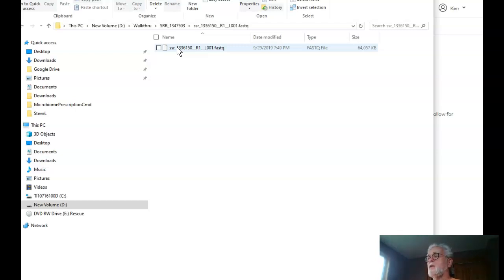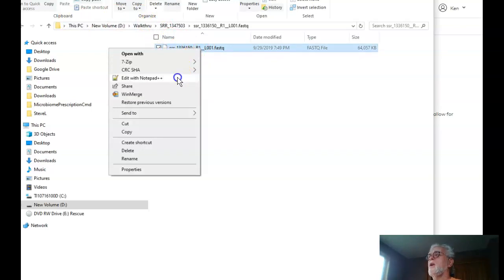So what we are now talking about is we have 8 files. We have the one zip with 8 files. Each of the 8 files expands to 64 megs, which means we have in total 8 times 64 megs, we have 500 megs, half a gigabyte of data. So we are talking about big data.